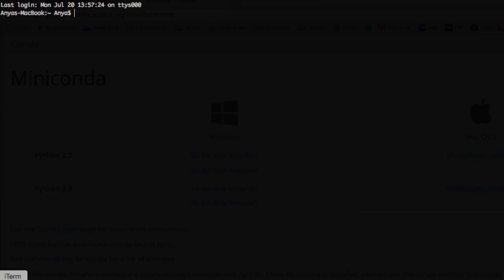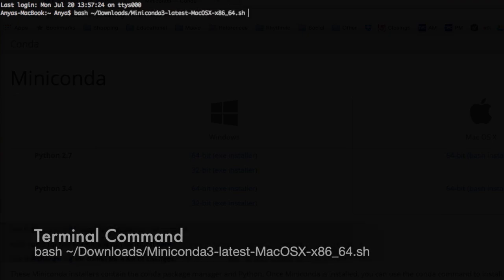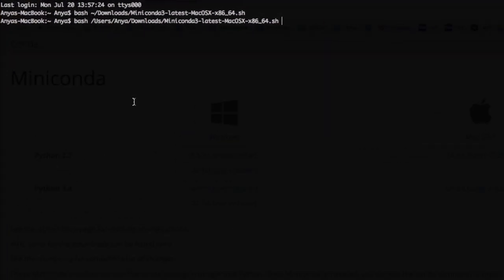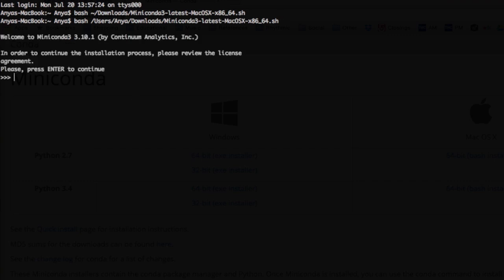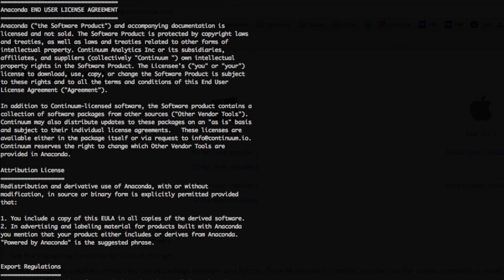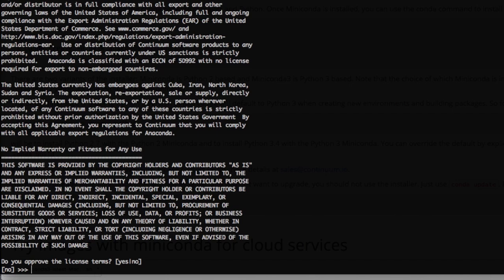Open up your terminal and type bash followed by the installer file path. Instead of typing, you can also drag the file to the terminal to get its file path. Follow the directions that appear, typing yes and pressing enter as necessary.